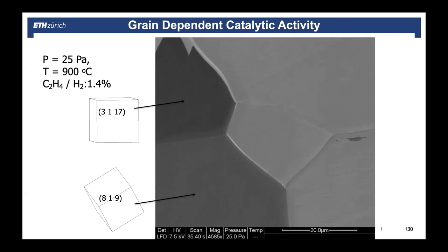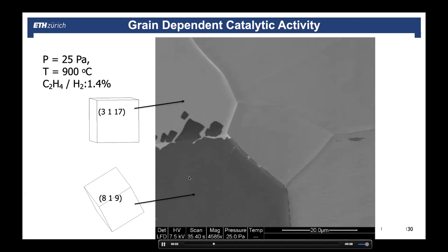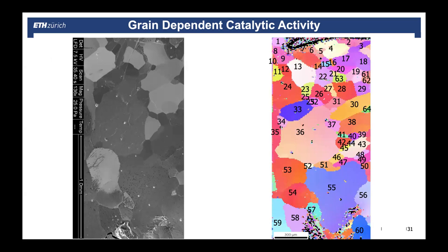And we did electron backscatter diffraction to really index the orientation of the different grains. So this is a 1-1-0 grain, quite active. And of course you can map all the orientations and then study why different grains behave differently. One is the surface arrangement of Pt atoms and the catalytic activity associated with that. And the other thing is, how easy is it to grow?